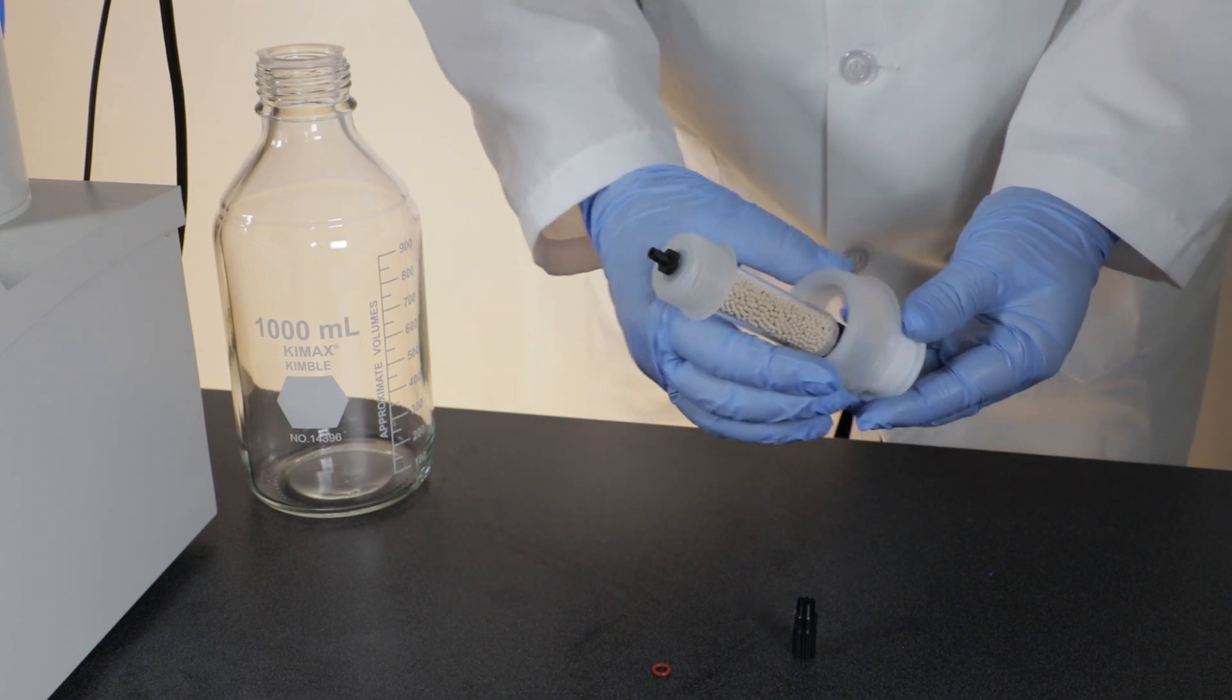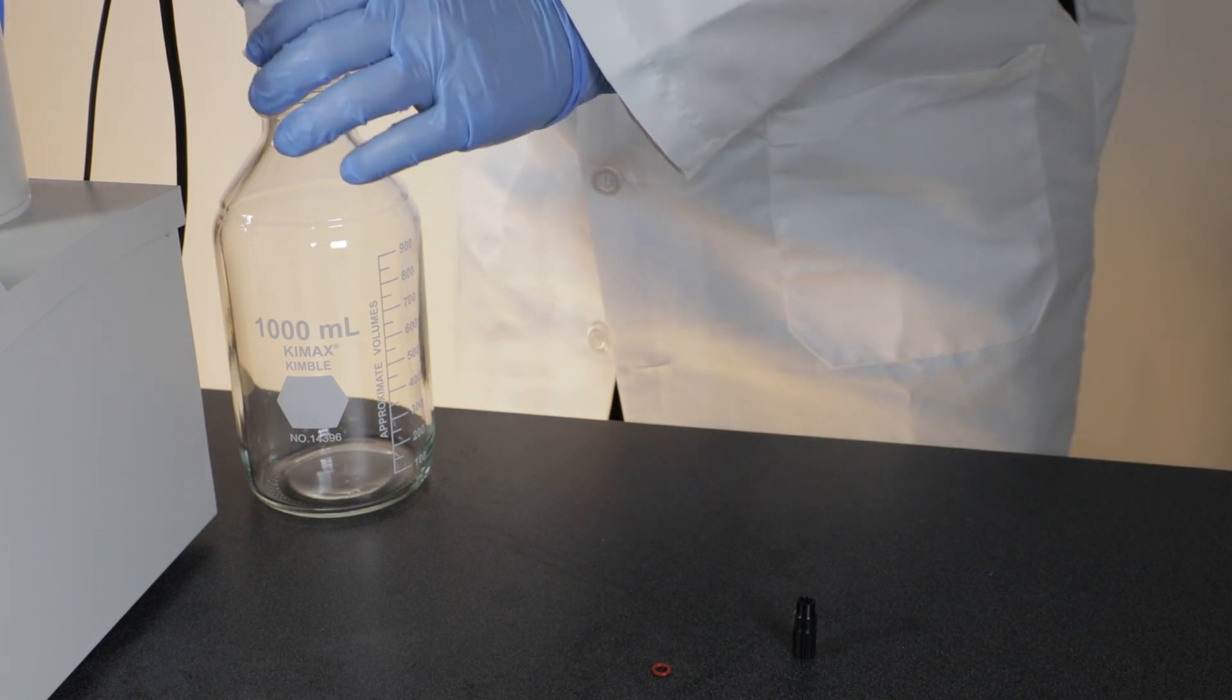Next, place a GL45 clear bottle screw cap over the assembly and screw it onto the waste bottle.